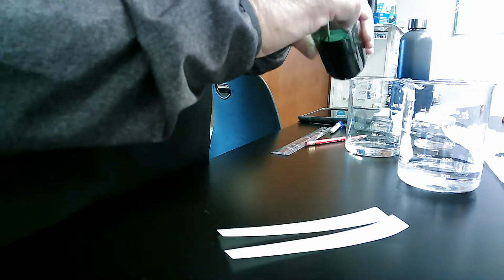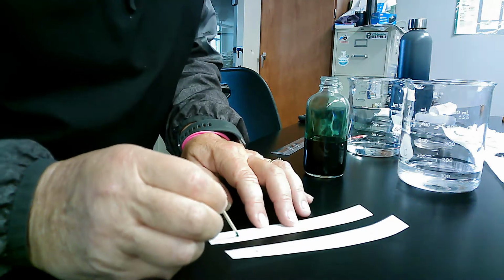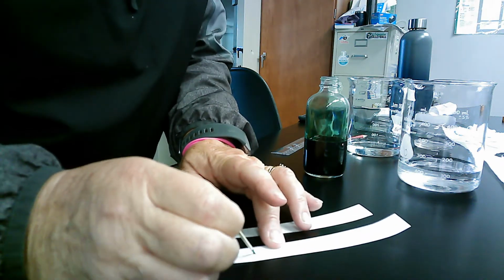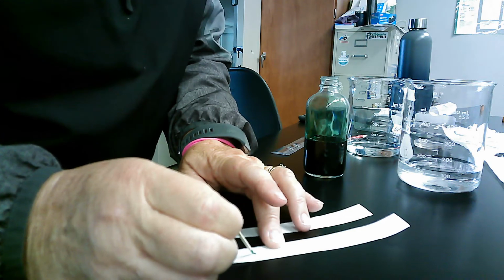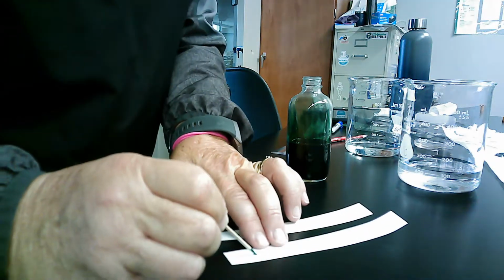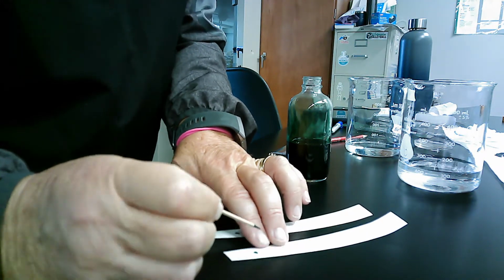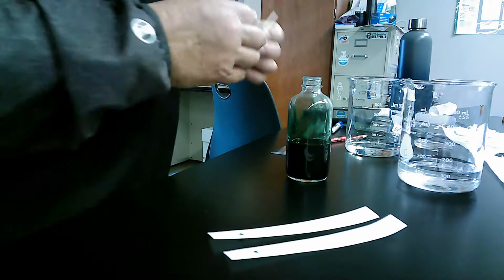I'm going to do it a couple different times. Let it dry a little bit, do a little bit more. I'm going to keep it so it stays concentrated in that spot, so that I'm really getting a good amount on there. The size of the dots, it's nice if you're consistent. The main thing is you don't want your dot to be too low. So I'm going to let that dry.